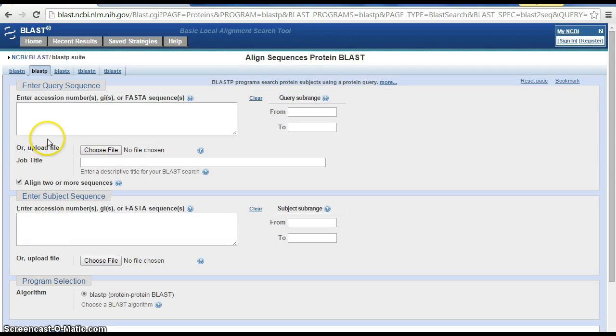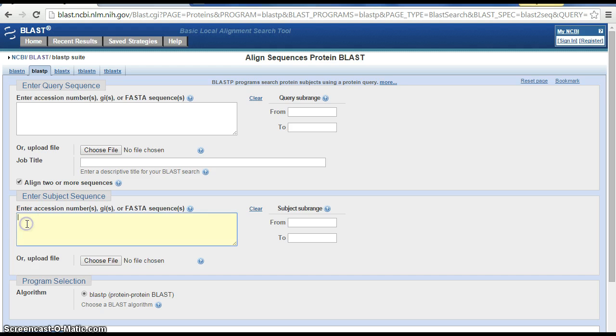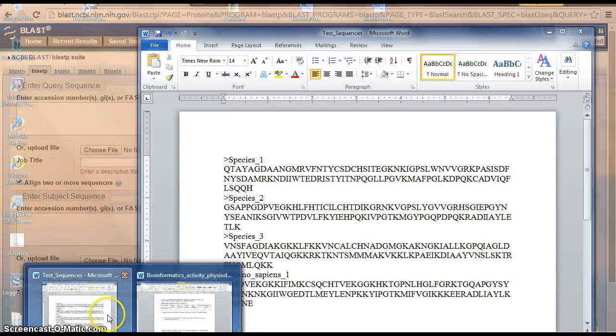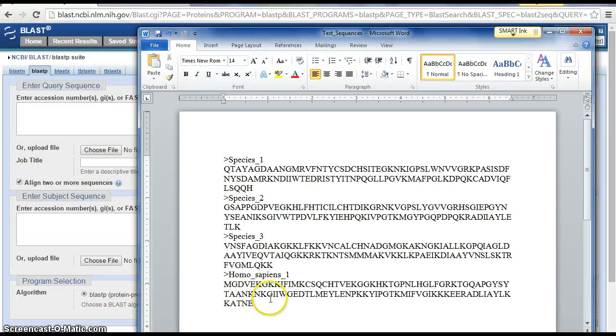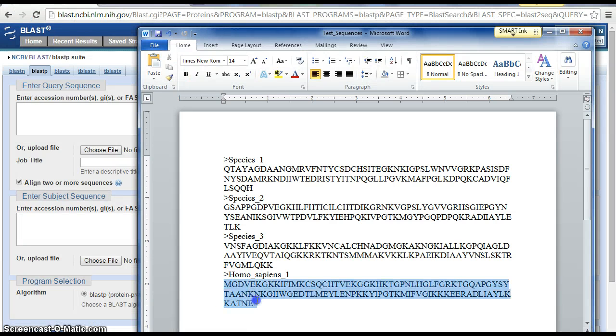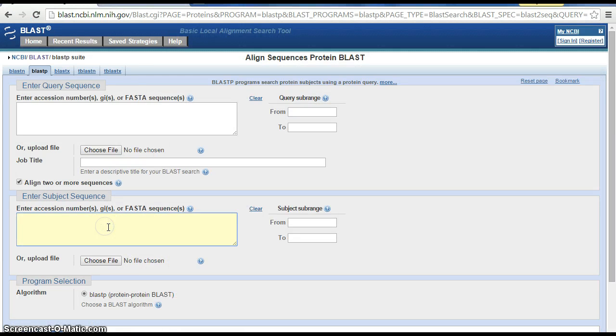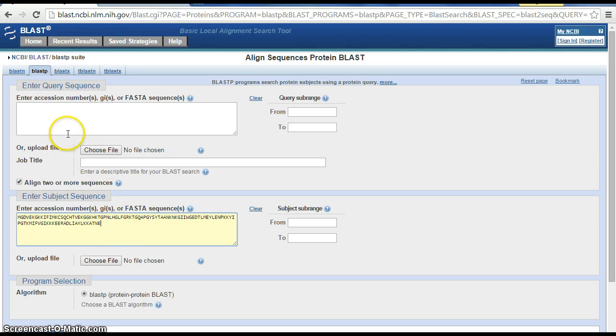Now two boxes show up, so we can enter our Homo sapiens sequence here in the subject sequence. Let's go to our list of test sequences and pick up Homo sapiens and copy and paste.